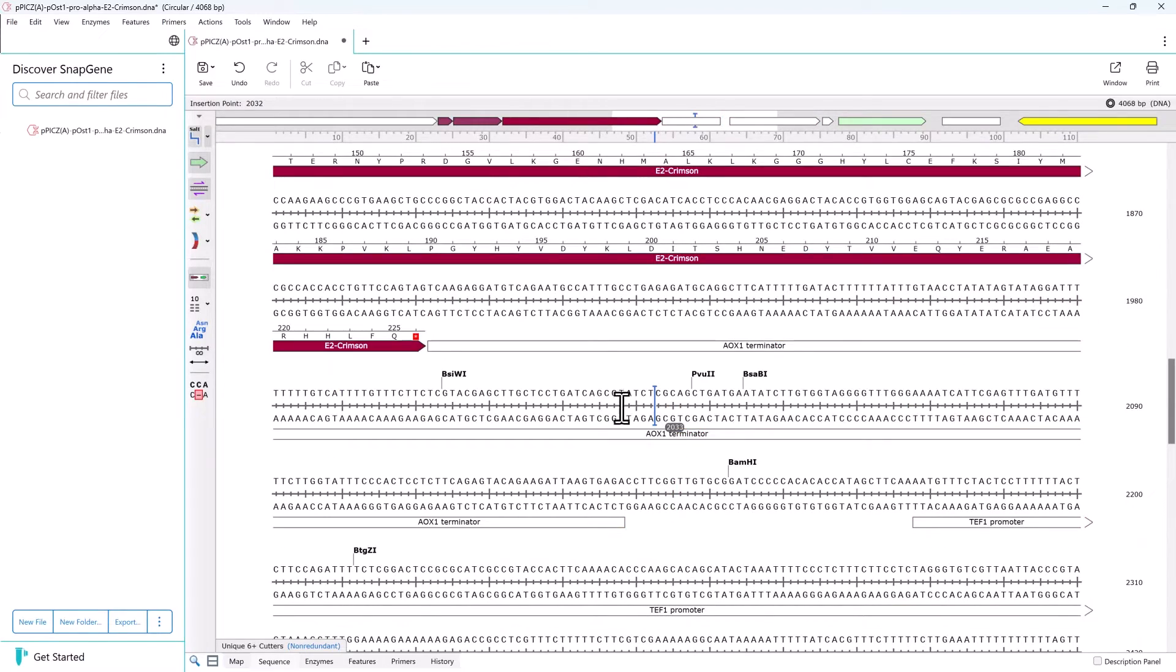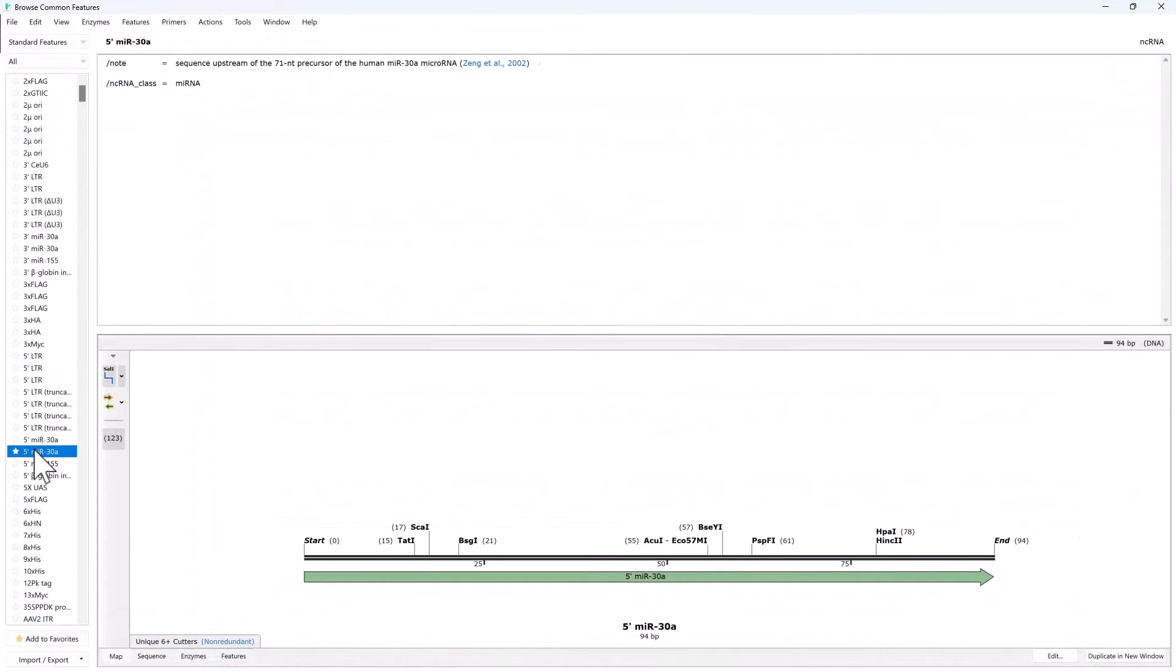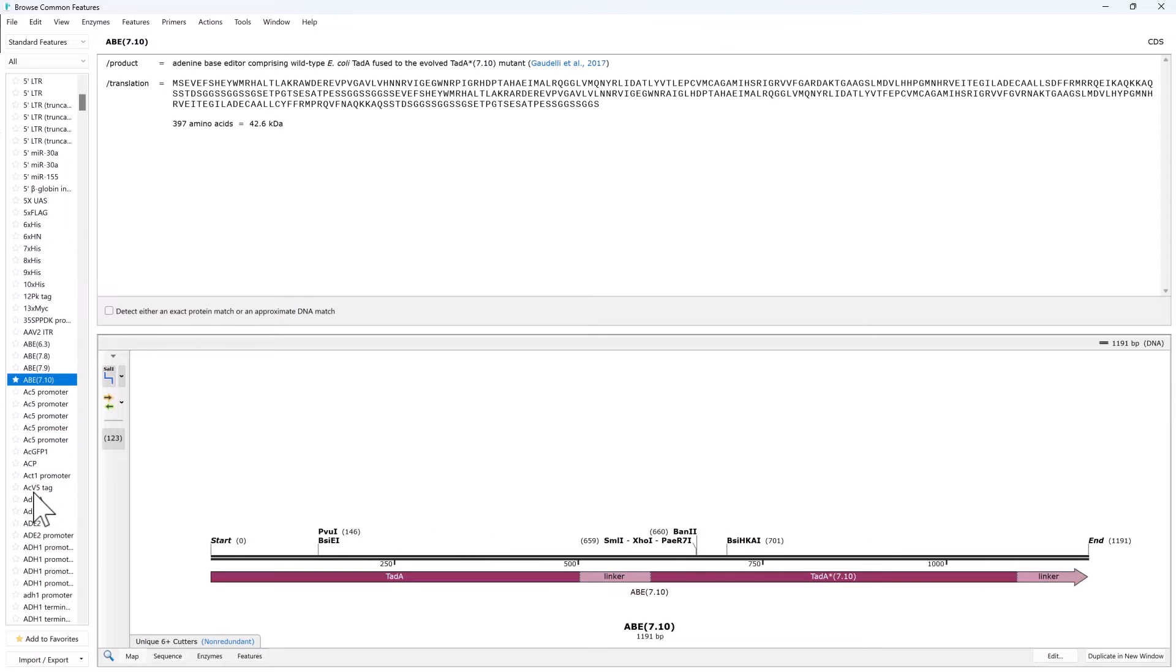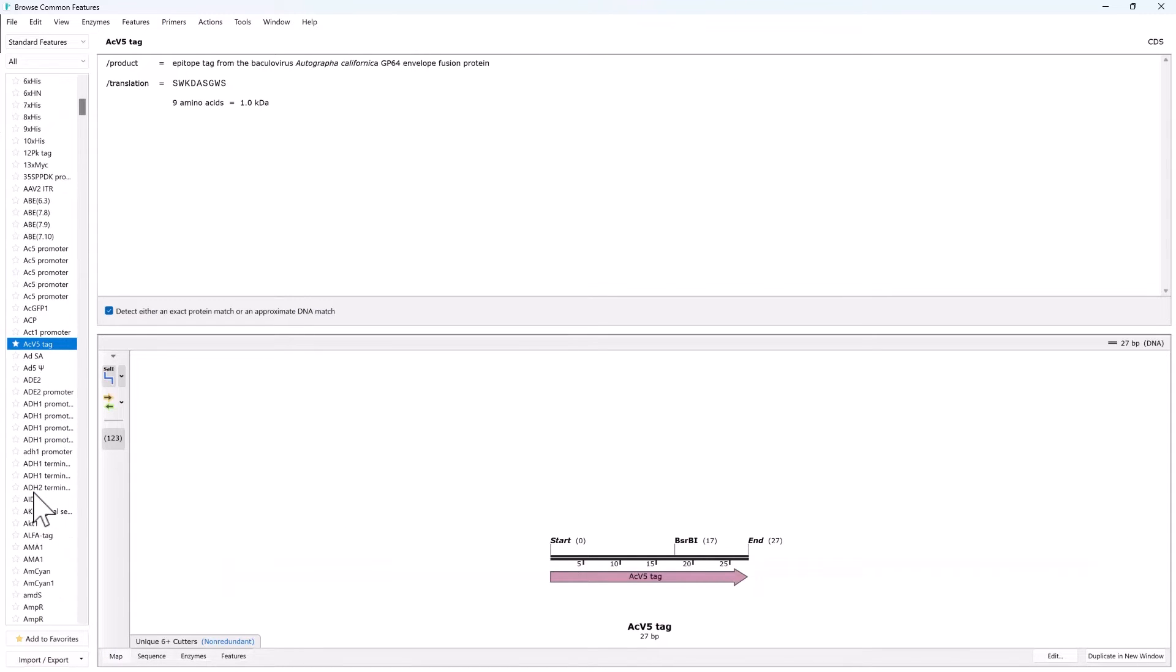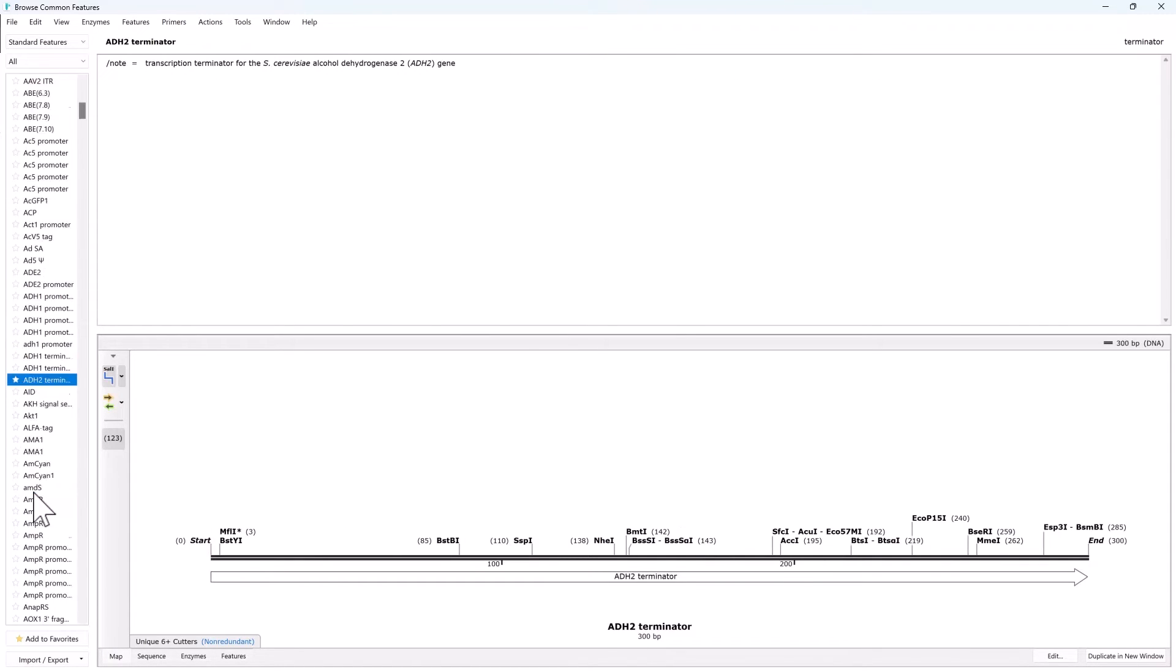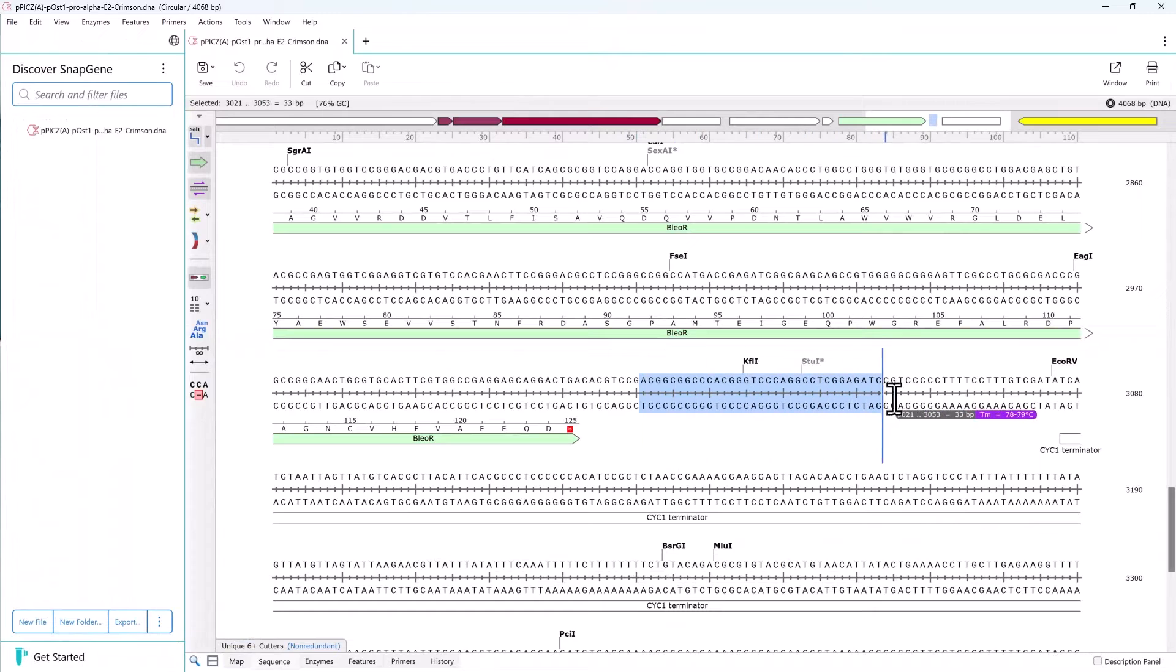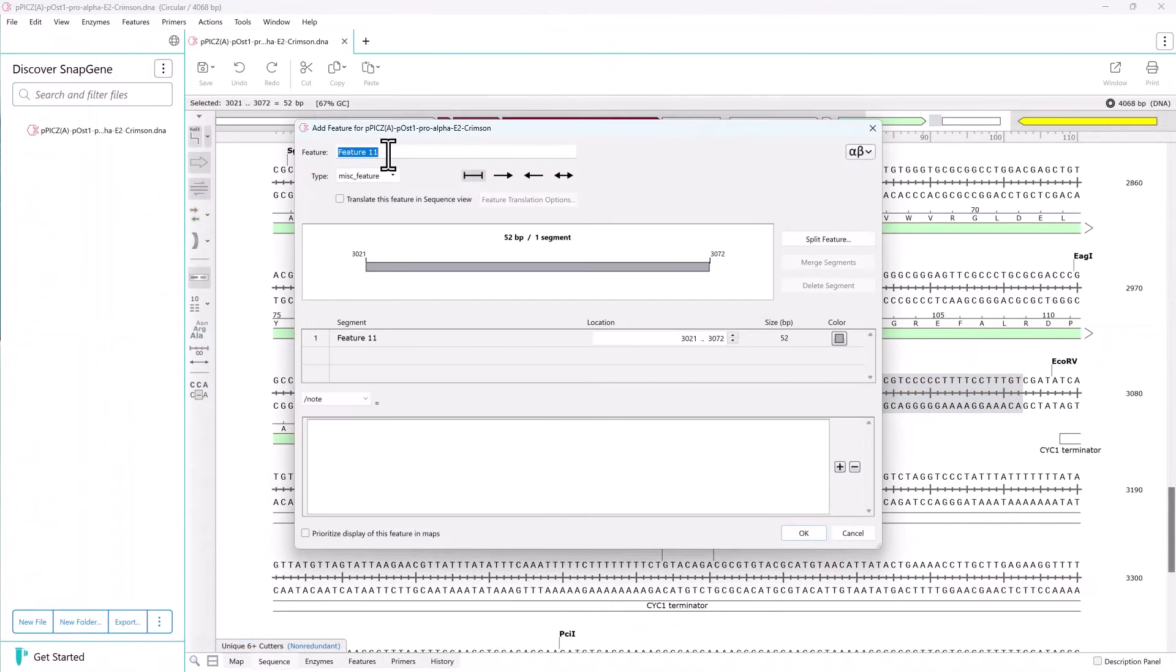This makes it easy to spot errors and understand in-frame fusions. This new sequence was annotated using SnapGene's built-in library of common plasmid features. However, you can also save your own custom features and then detect them on your new sequences.